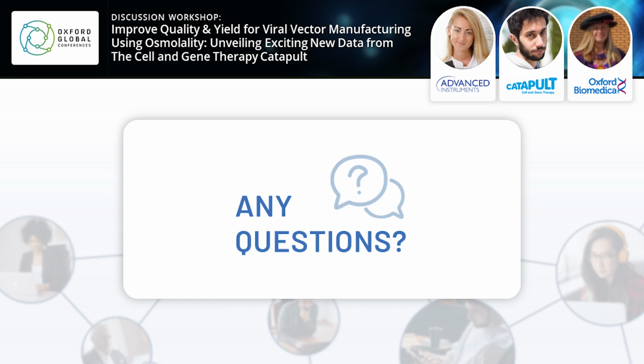one of those numbers. And maybe as well having a look at another AAV like 8 that is mainly extracellular, and see if we could basically try to reach almost everything into the supernatant. But I would expect to see a similar trend. But of course, we have to test it.